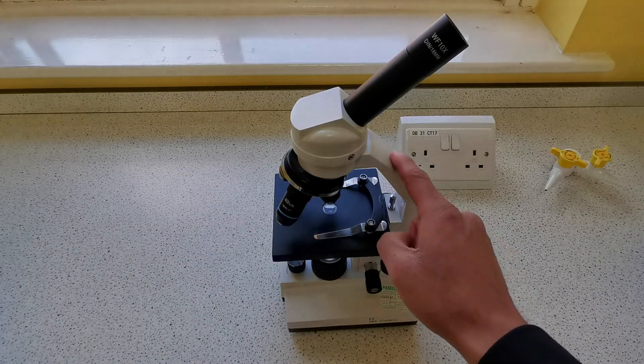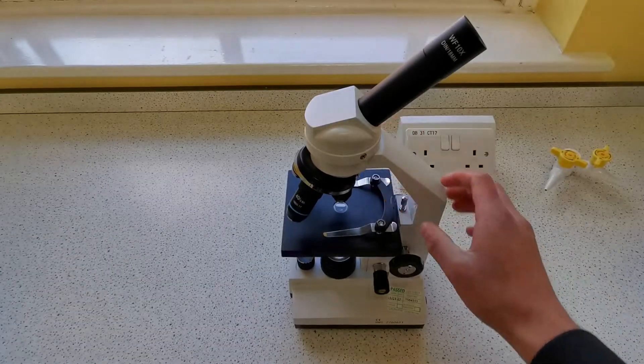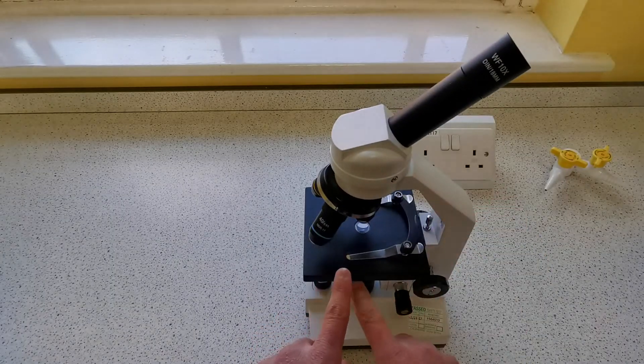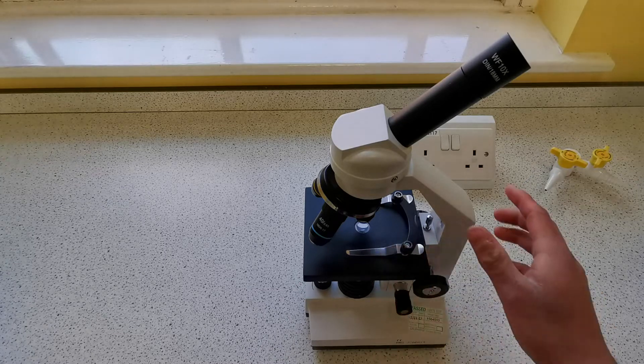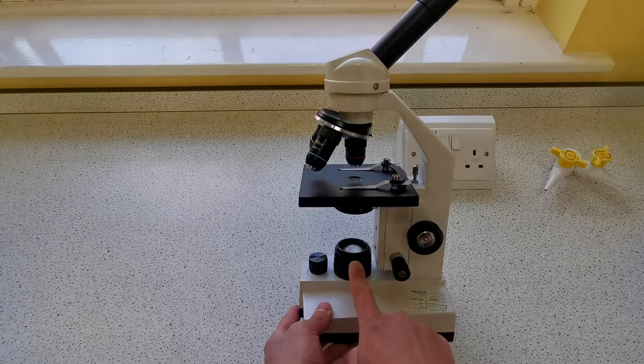Along the side we have the arm — this is what we hold the microscope from. Below that we have the stage, the clips which we use to hold the slide in place, and then below that we have the light source.